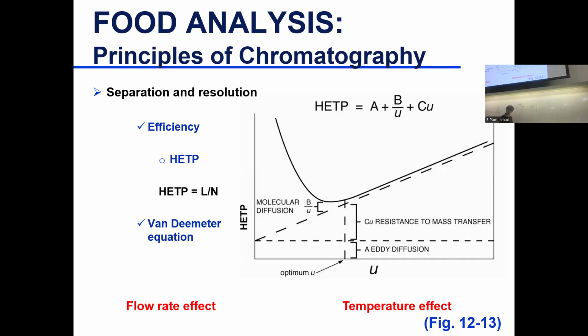Also, when we cover HPLC, we'll talk about those micro tubes. So the narrower the column, the better is the resolution. So narrow and long, better resolution. Because then you don't have a lot of stationary phase for the compound to just go in and get lost and diffuse and all of that. So the narrower the column, or if you use a capillary column, the better is the transfer factor, or the smaller it is. You need a smaller transfer factor to have a smaller height.